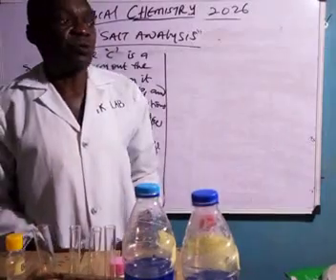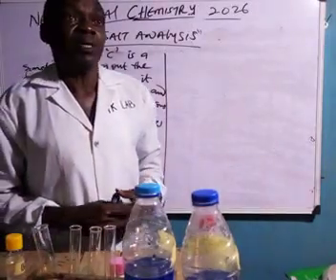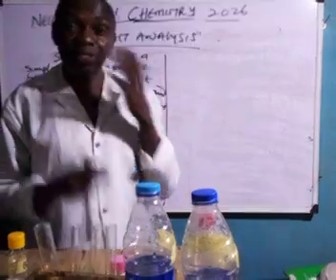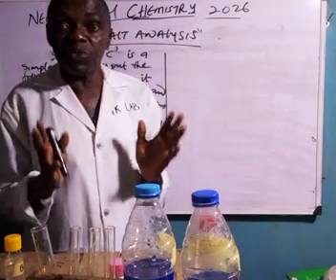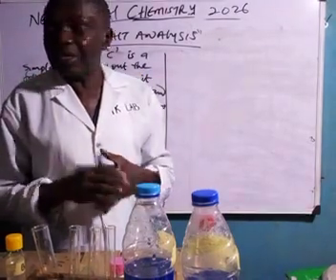Welcome back to class. Remember, we already had the first part, which is on titration, quantitative analysis. Now we are going to have a look at the salt analysis. Remember, this is just for trial purpose, for educational purpose. It's not an expo. Just try to follow so that we don't have difficulty when analyzing things.